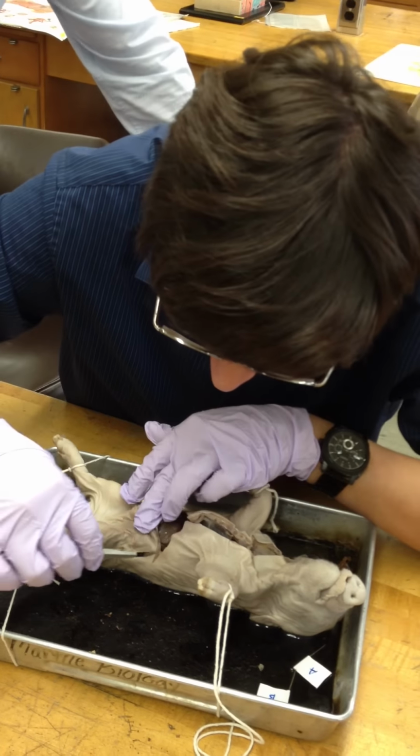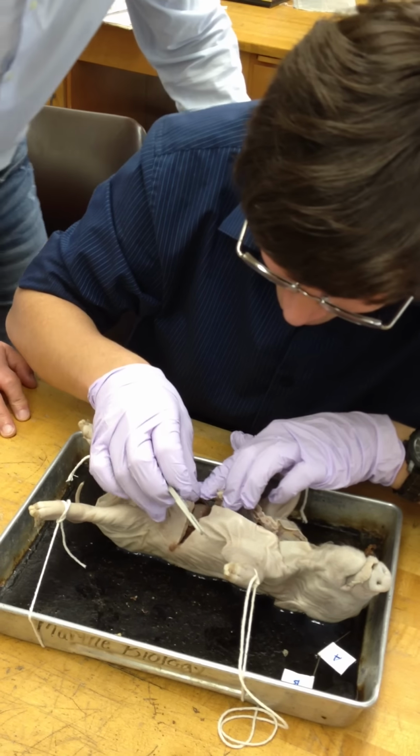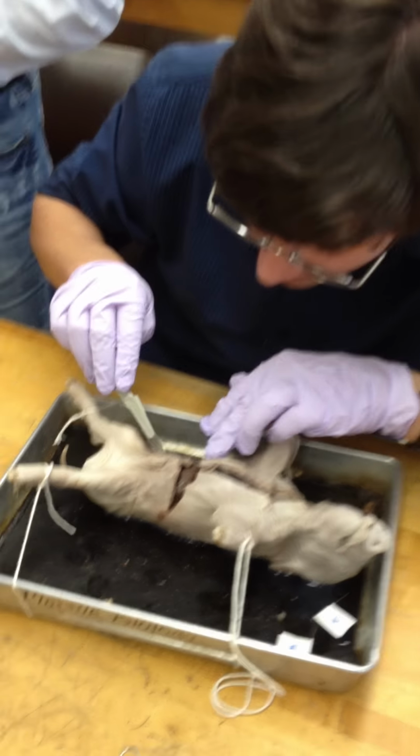So you're doing... Okay, gotcha. I'm just cutting it. Yeah. If you want it done right, you're going to have to take over. Okay, this is attached right here. I think that makes sense.